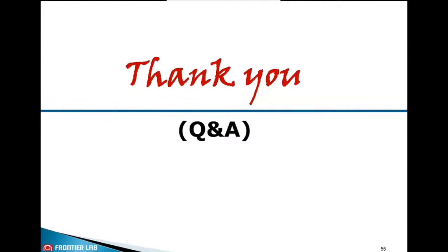Sometimes results are carried forward, that means the reading of a previous sample carries forward to the next one. Is there any solution for that? I'm not sure, because most of the time it could be that your column run is not long enough. Or the temperature you set may not be enough. So you have to give more information to answer this question.